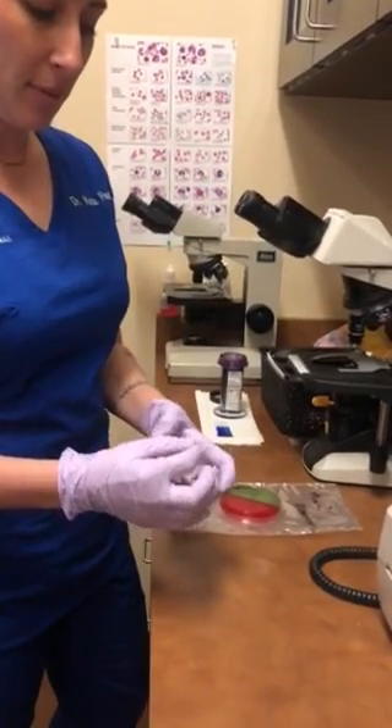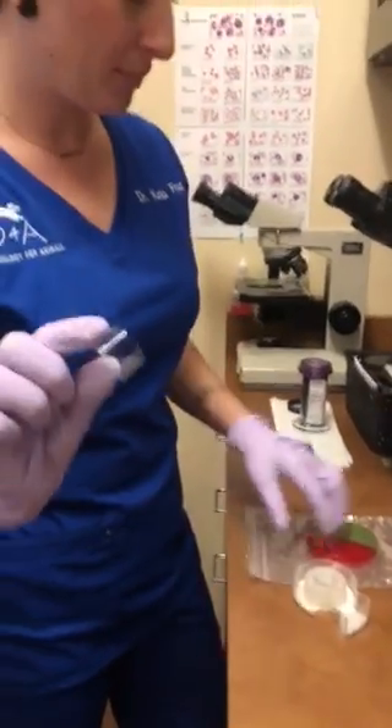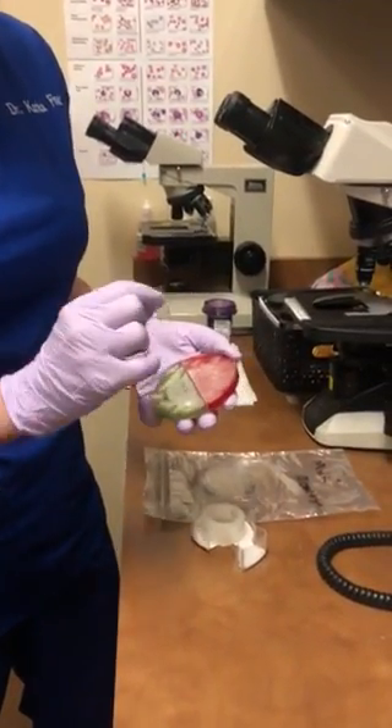Take a piece of tape, sticky side down, and just make a little loop like that. Then look in your colony plate and pick a colony to press the tape to.